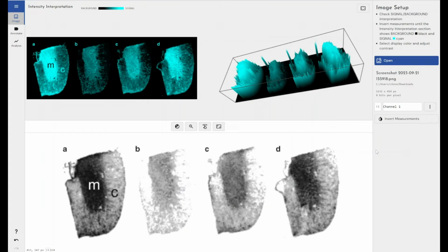So you may know it as phosphor imaging, or you may have heard of it as autoradiography, where essentially a radio-labeled ligand binds to a sample and produces an image, in a very short description. Now, phosphor imaging or autoradiography can be used to image things like bands on a gel. So it can be used for DNA and RNA analysis and Western blotting and things like that. Largely that's been replaced by chemiluminescence, but it is still out there.